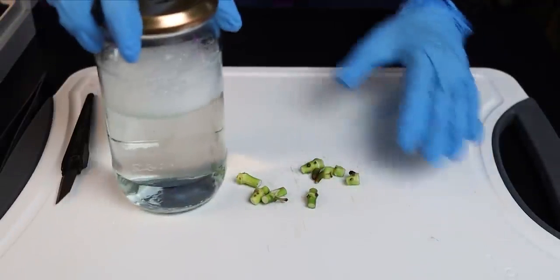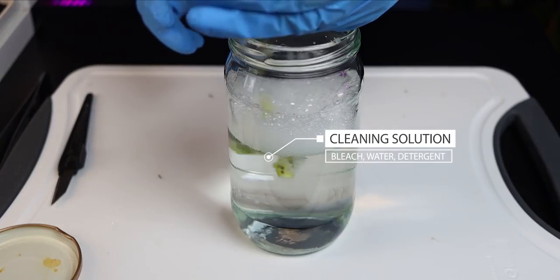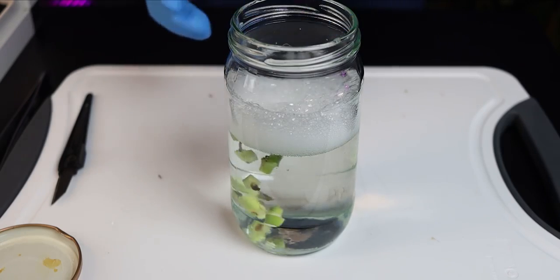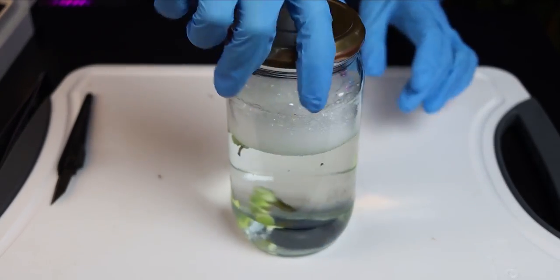It's time to clean the nodes, so I'm washing these in a solution of 10% bleach, a little bit of water, and a little drop of dish soap. Now why dish soap, you may ask? Basically, it breaks the surface tension of the water surrounding the plant material, which allows the bleach solution to penetrate all the nooks and crannies and sterilize the plant material.